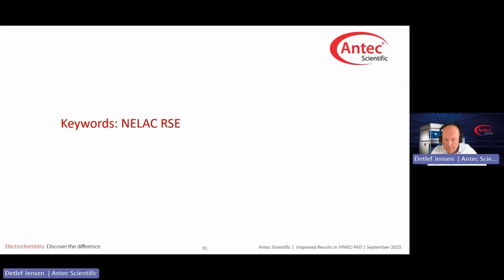So what now? So when we learned about the correlation factor, or the not use of the correlation factor, we looked for guidance. And using the right keywords, and there's 2 keywords on top of the screen at the moment, and your favorite browser, you will find excellent resources. And one I find specifically helpful is the website of the NELAC Institute.